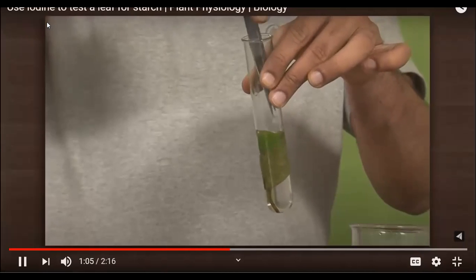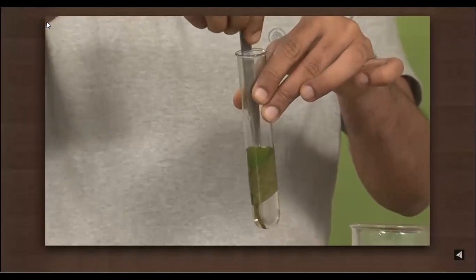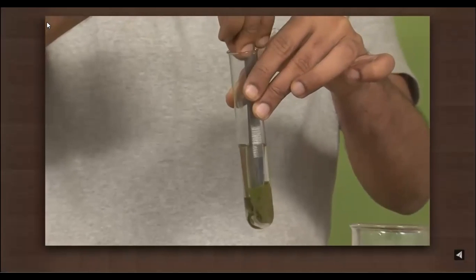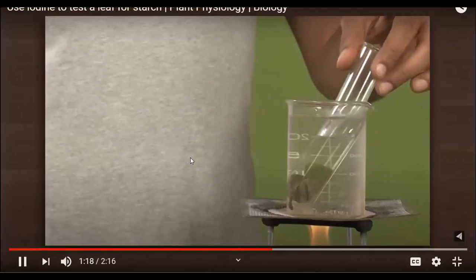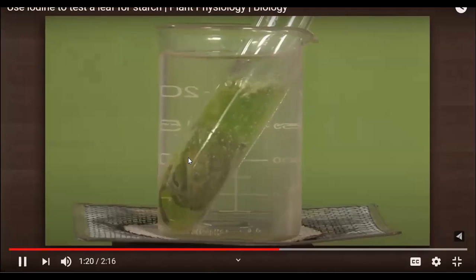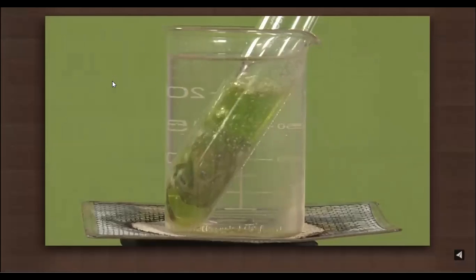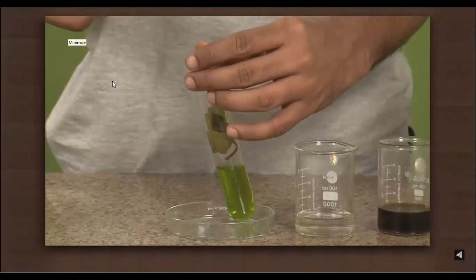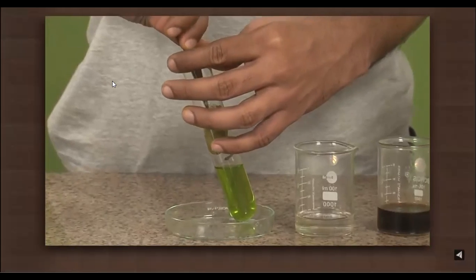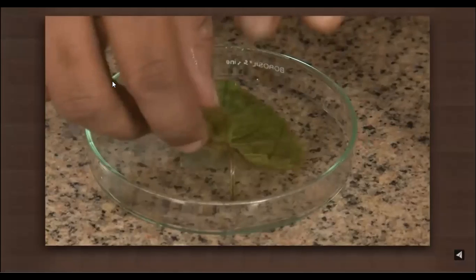So make sure that the leaf is properly dipped in the alcohol, completely dipped in. Keep the test tube in the boiling water. The chlorophyll slowly dissolves into the alcohol. Note that alcohol turns green. Removal of chlorophyll will help us observe the color change of iodine clearly. Place the bleached leaf in a petri dish.